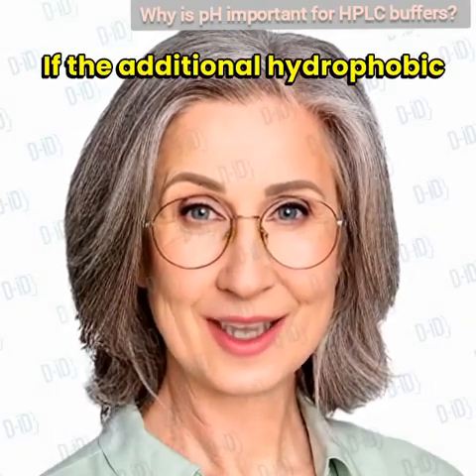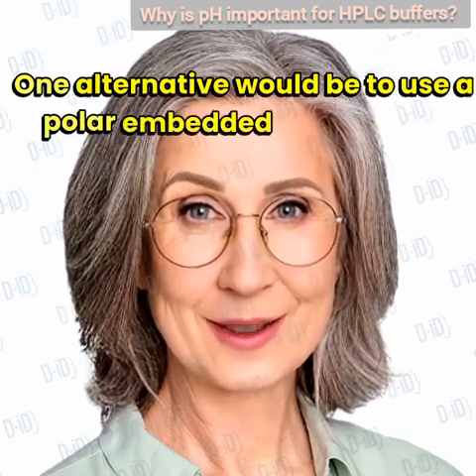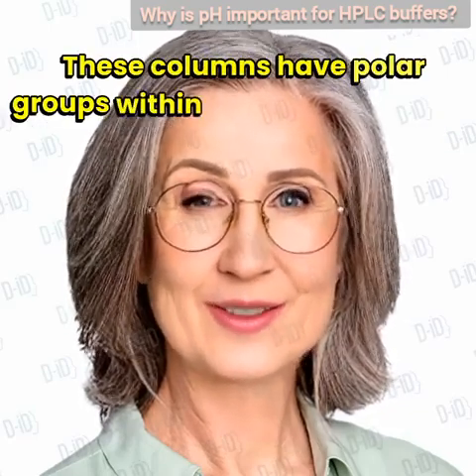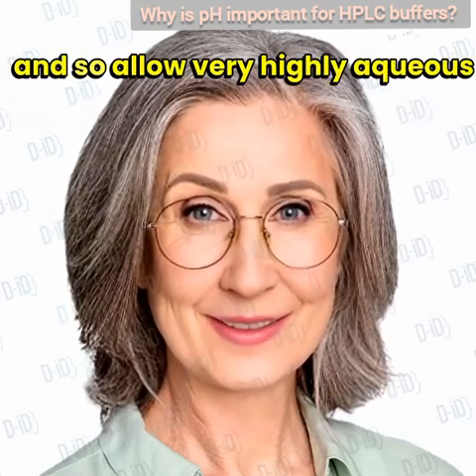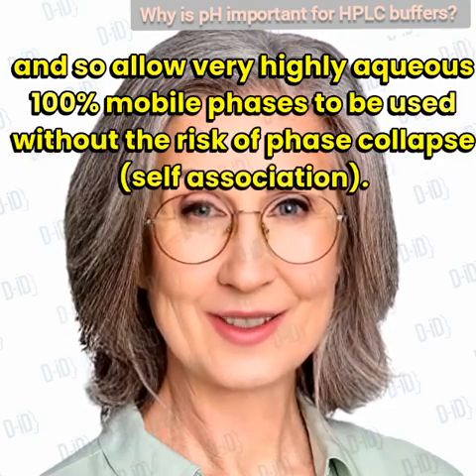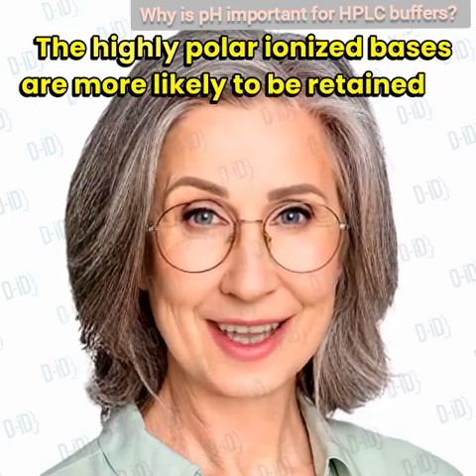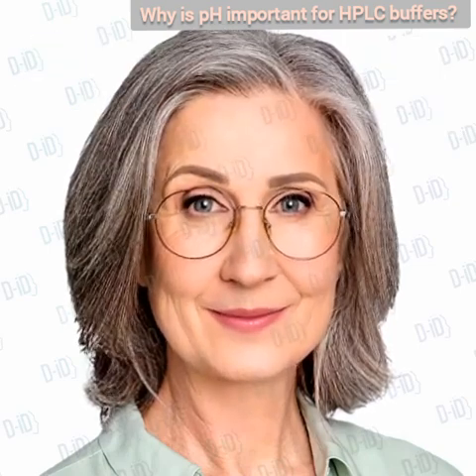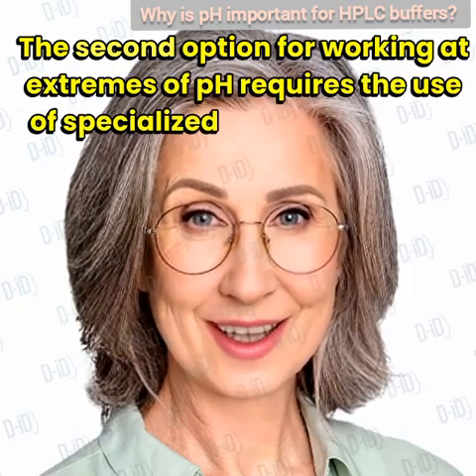If the additional hydrophobic interactions do not provide sufficient retention for the analyte, one alternative would be to use a polar embedded, or polar end-capped column. These columns have polar groups within, or end-capped onto the silica backbone of the column, and so allow very highly aqueous, 100%, mobile phases to be used without the risk of phase collapse, self-association. The highly polar, ionized bases are more likely to be retained by the increased polarity provided by these more polar RP stationary phases.